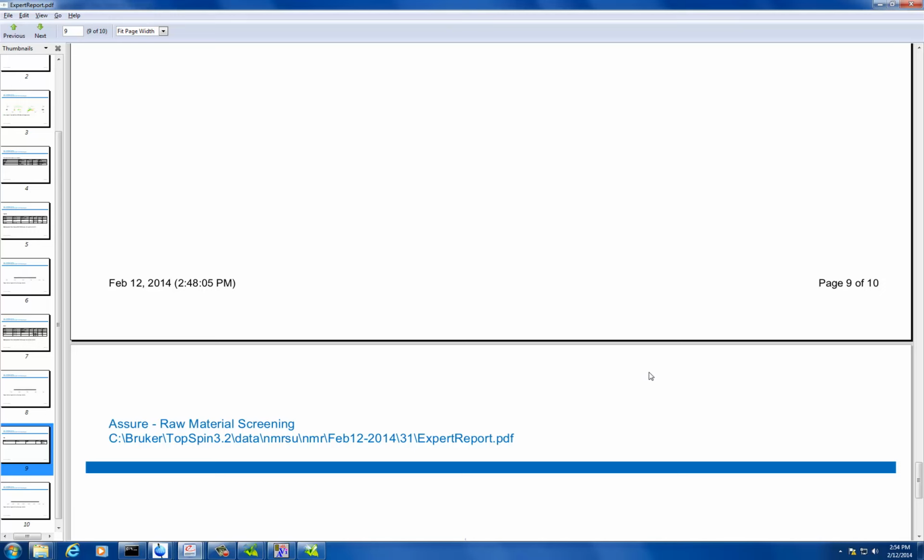Yeah, I think probably I'd want to purchase one just to be certain that it really is the concentration that it claims to be. Because I think our balances are okay for our purposes, but not for our standard. I'd rather be more accurate for this. And since you guys have other analytical tools, if you do make your own, then you can verify it with another HPLC or something like that, and then use that concentration information. Well, we could.